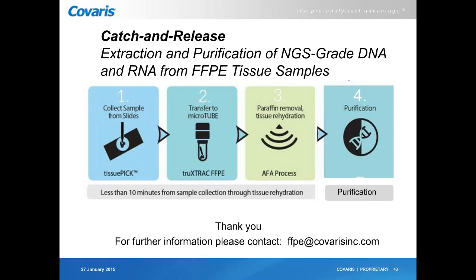What was the humidity of the room? All these parameters have an impact on the RNA quality. Honestly, in some cases, especially for RNA, it's very difficult. Regardless of the extraction technique, if the sample has not been stored properly and for too long, you can't get the quality that's required for NGS application.